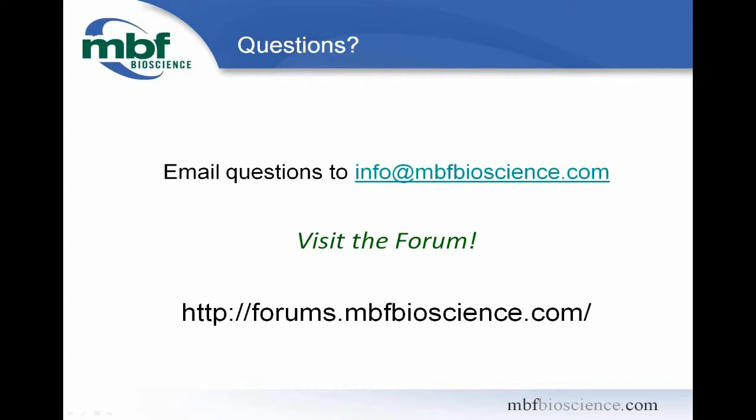Kate has a very good question. She asks, does the software acquire images using one filter then the other, or does it switch back and forth between filters in each section? Kate, the answer to that is that it can do both, and it's up to the user to decide which of those two options they would prefer.